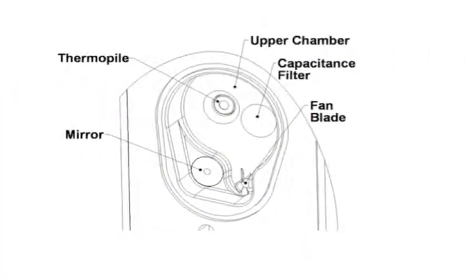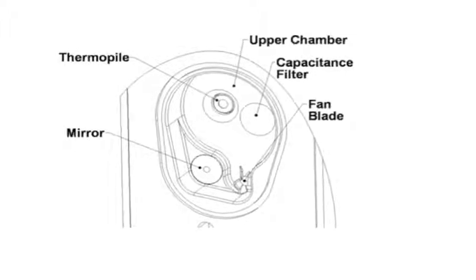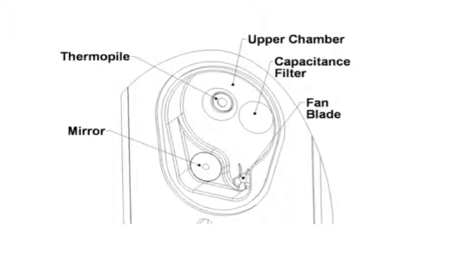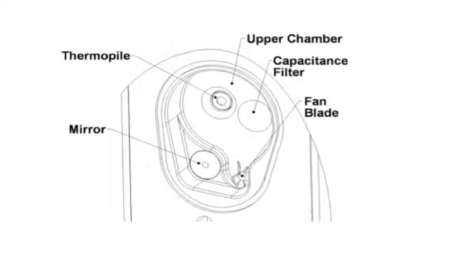Take a moment to notice the different components of the sensor block depicted here in this diagram. We'll be cleaning the thermopile and the mirror. Please also note that unless you have the TEV version of the Aqualab, you won't see anything where the capacitance filter is depicted.